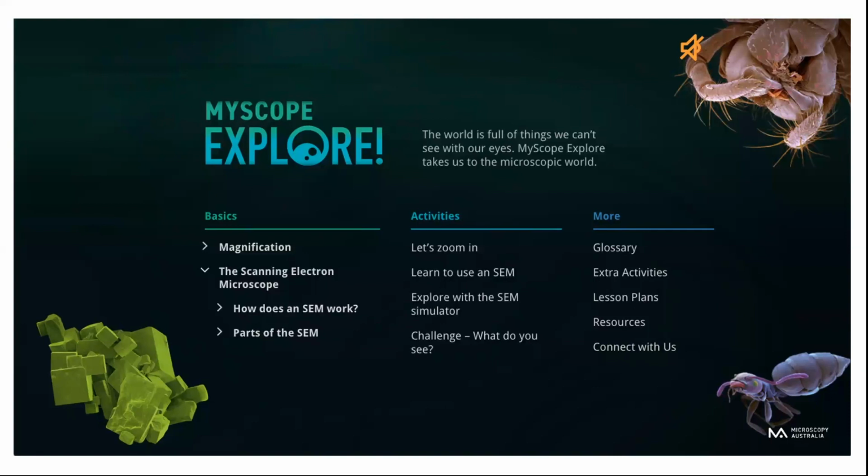This is the front page. It has a lot of information about basic magnification. What is magnification? What is focus? It's also very tailorable for kids from about 7 or 8 upwards. You can go into as much detail as you want, if the kids are really interested in the physics and the engineering side, how does an SEM work and all the different parts. But then there's the Let's Zoom In activity, which is really simple. There's also the simulator and challenges, and a whole lot of extra activities, particularly relevant for teachers.